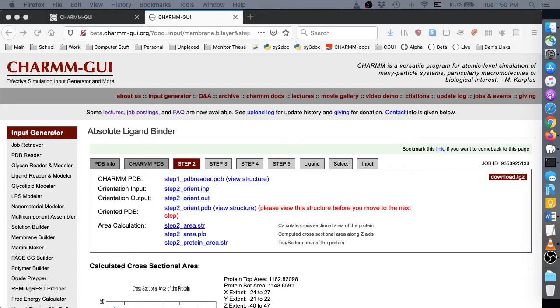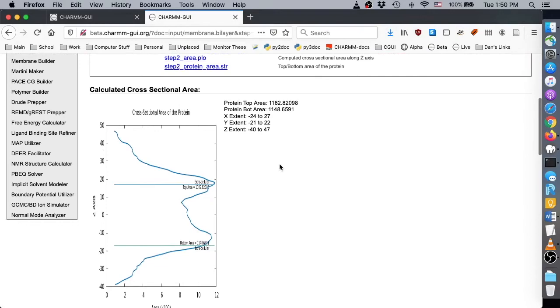On this page, we can check the calculated cross-sectional area along the z-axis. Make sure to click View Structure to ensure that the protein was properly positioned within the membrane.